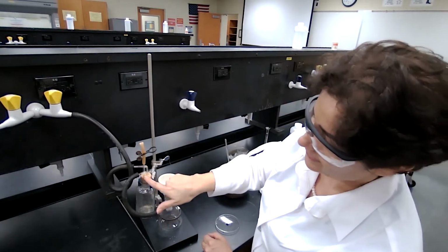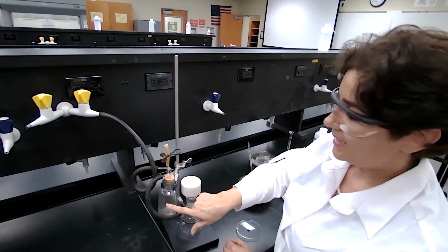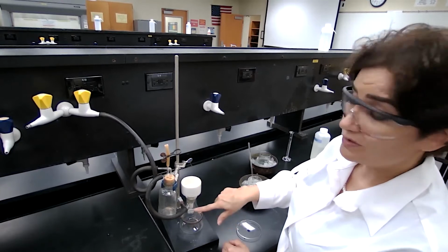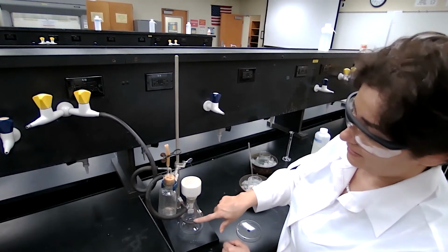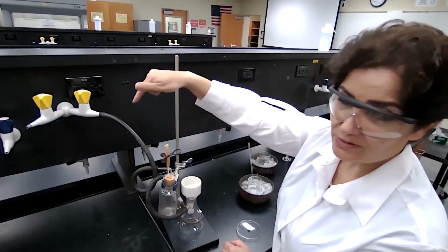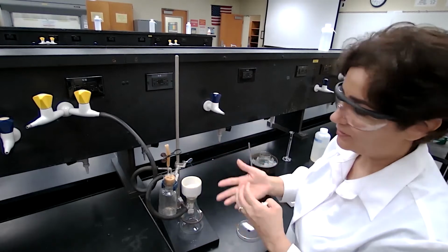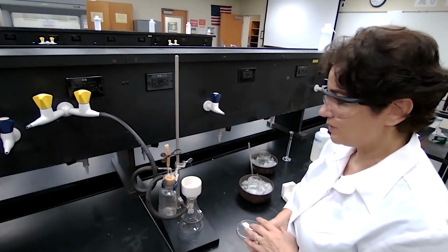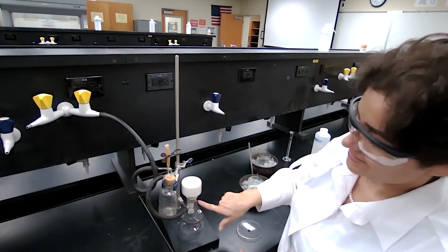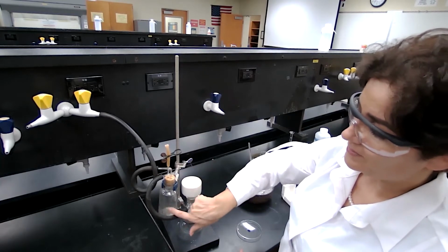I want you to pay attention to this necessary piece, called a trap. In case you are not paying attention and too much liquid has accumulated in the filter flask, the vacuum is going to pull that liquid and could send it to the vacuum pump. And of course, water and electrical devices do not work well together, so it's going to burn the pump. So we put this trap, so in case any liquid goes into the vacuum tube, it would be trapped in this container.